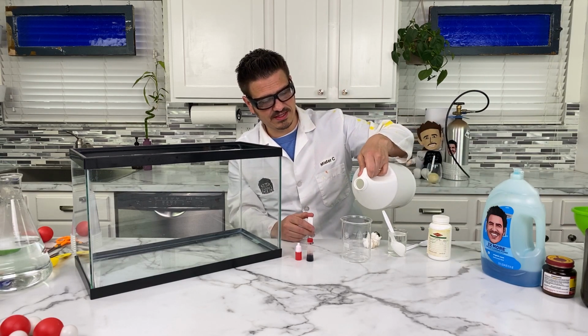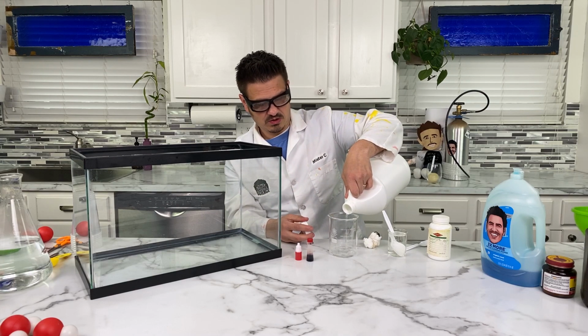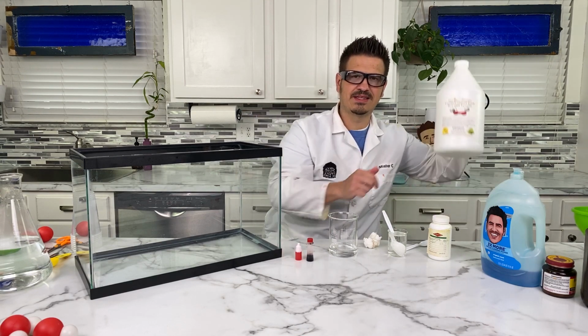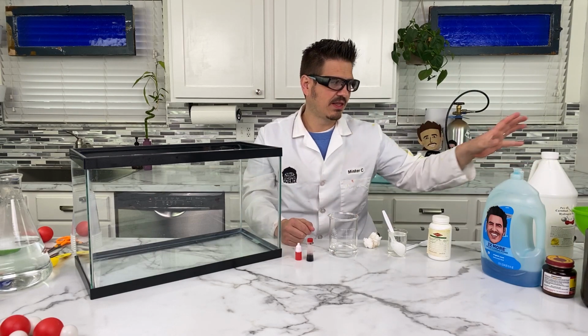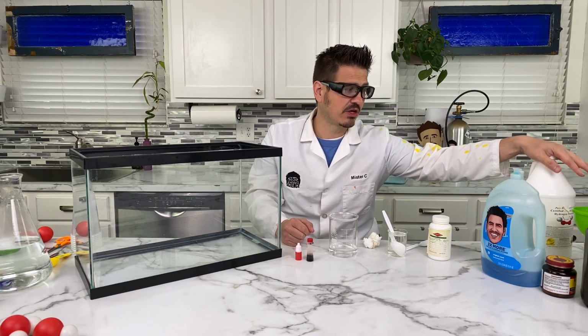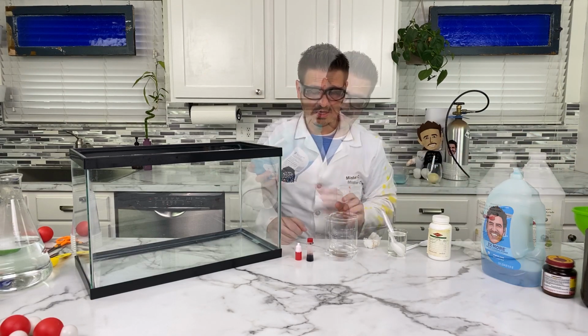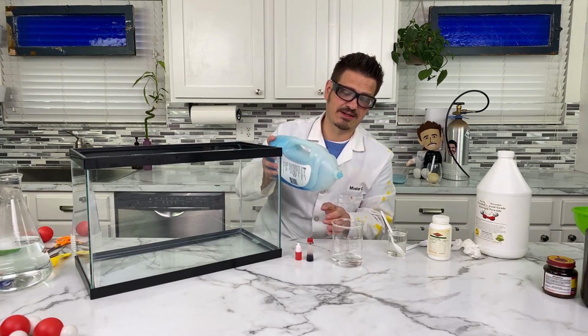I only have a little bit left. This is an older container. And so my question is, is this still going to work? All right, because we were talking about this decomposition. The hydrogen peroxide decomposes naturally over time. It breaks the oxygen molecule off, and then it has water. All right, so we have our 35% hydrogen peroxide in here.